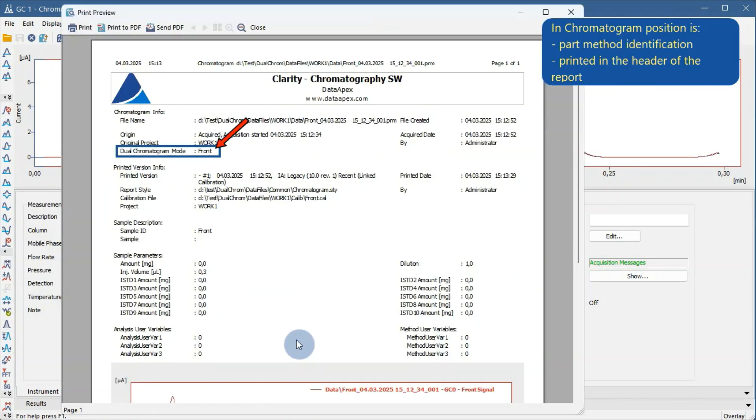Reports generated in this mode automatically include a dual mode field, labeling whether the chromatogram corresponds to the front or back position.